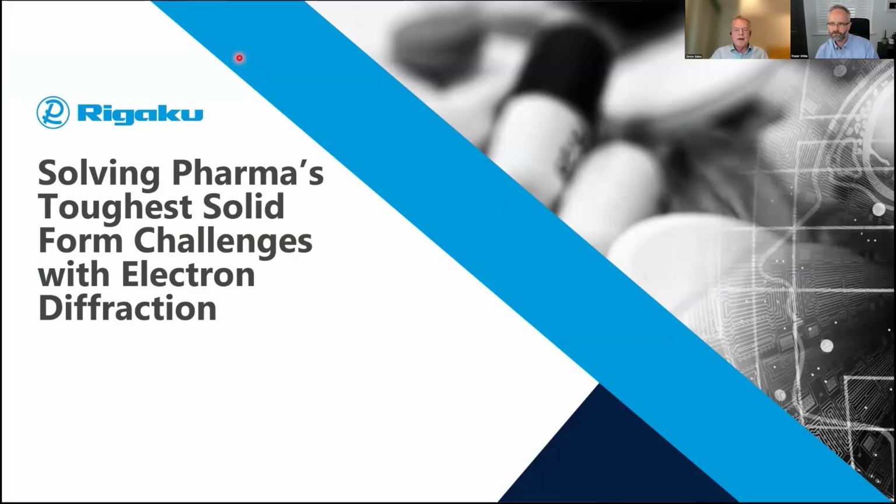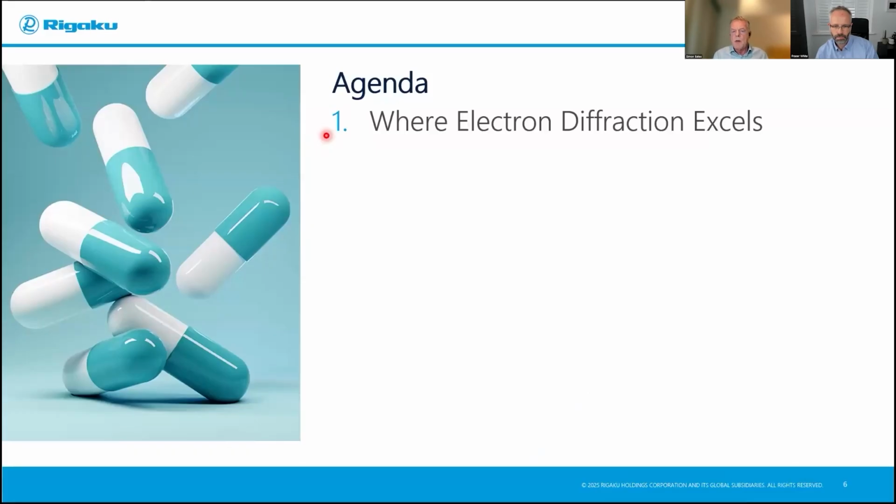Sure. Thank you, Fraser. Thanks for the introduction. Greetings, everybody. Welcome. And thank you all for joining our webinar today about solving pharma's toughest solid form challenges with electron diffraction. In the webinar, we'll be talking about where electron diffraction excels in the drug discovery and development pipeline.